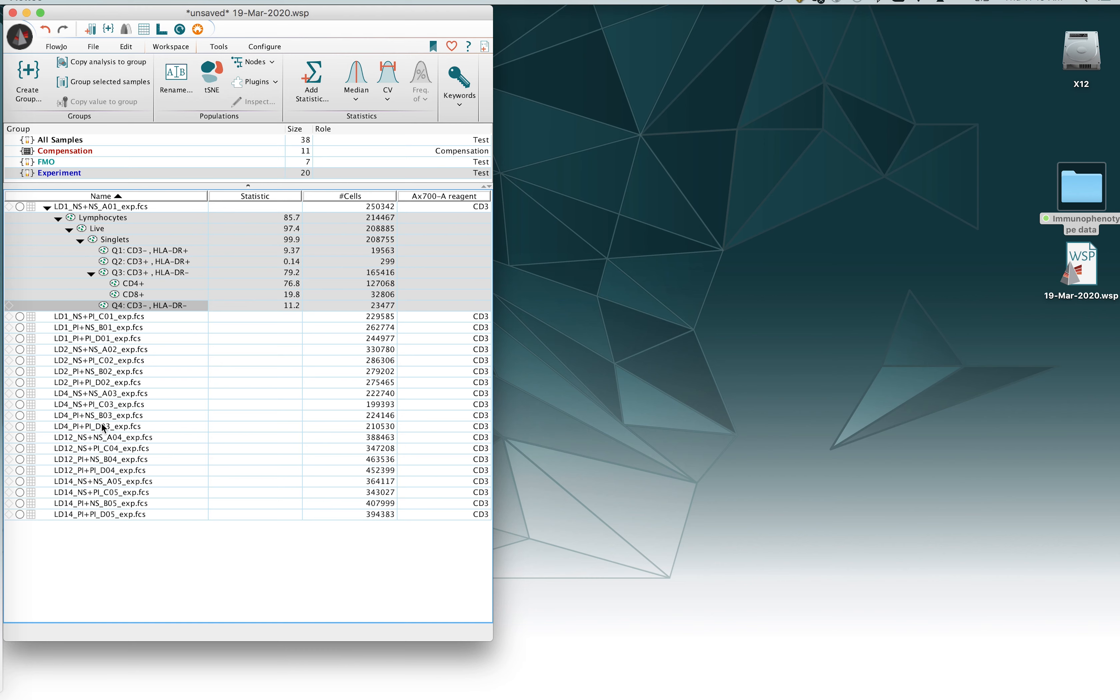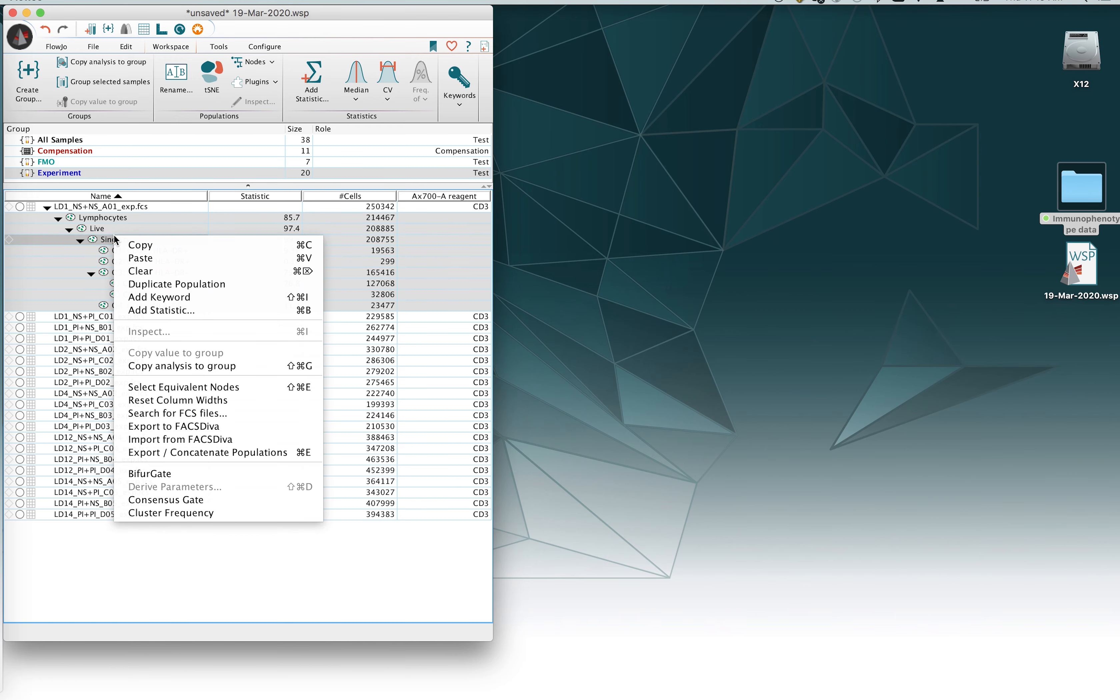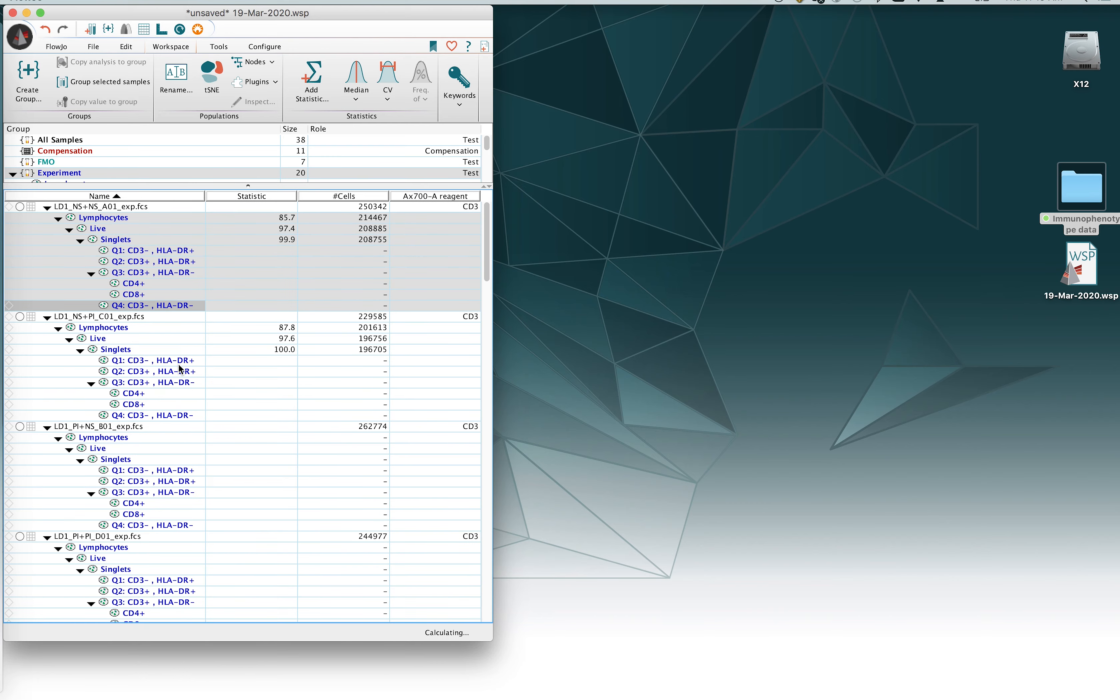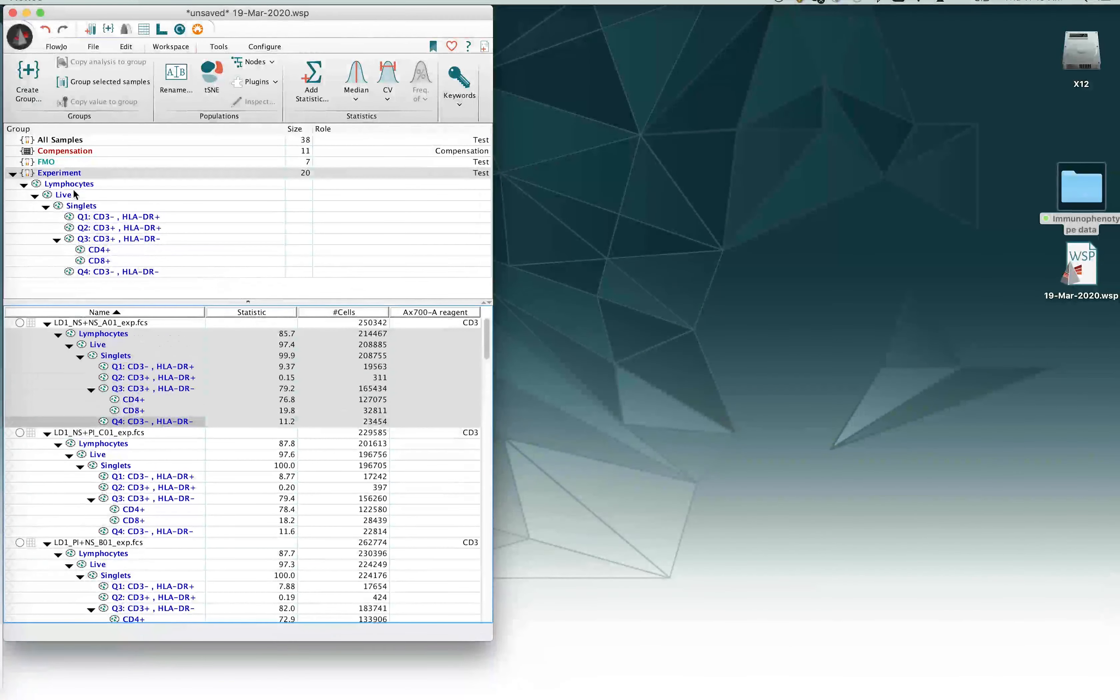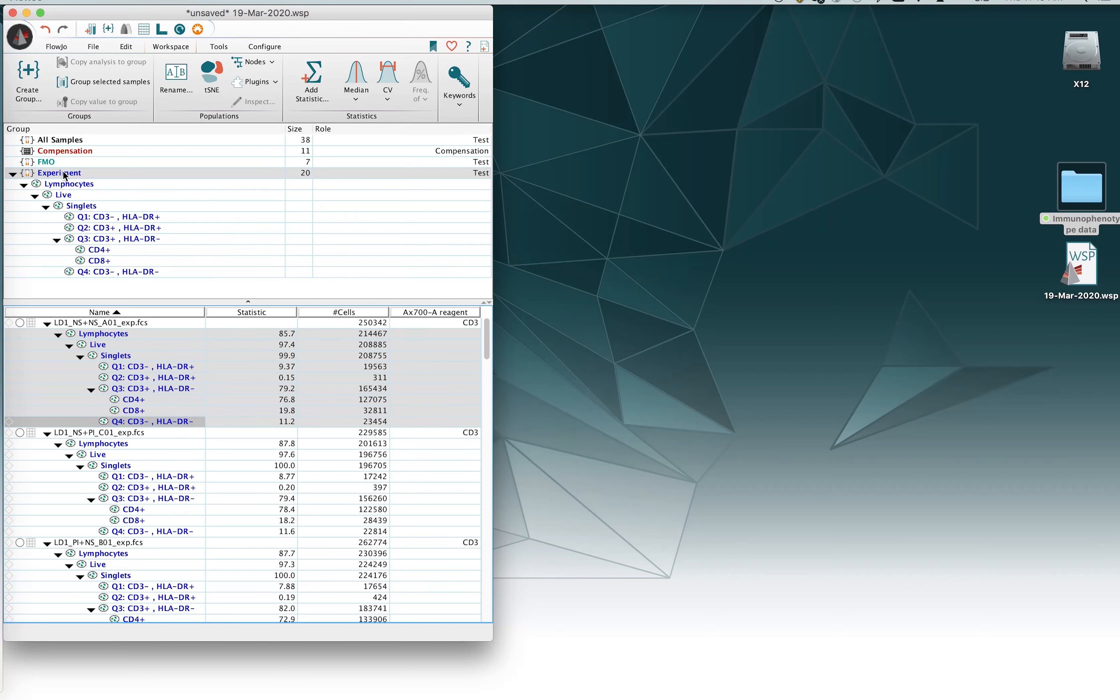The way to do this, in my opinion, the fastest, easiest way to do this and the tool of choice is to go ahead and right click on the highlighted gates. When you right click, go down to the option that says copy analysis to group here. The command shift G is a very good tool for this purpose. You say copy analysis to group and that will copy those gates to the group that we're working in, in this case the experiment group.